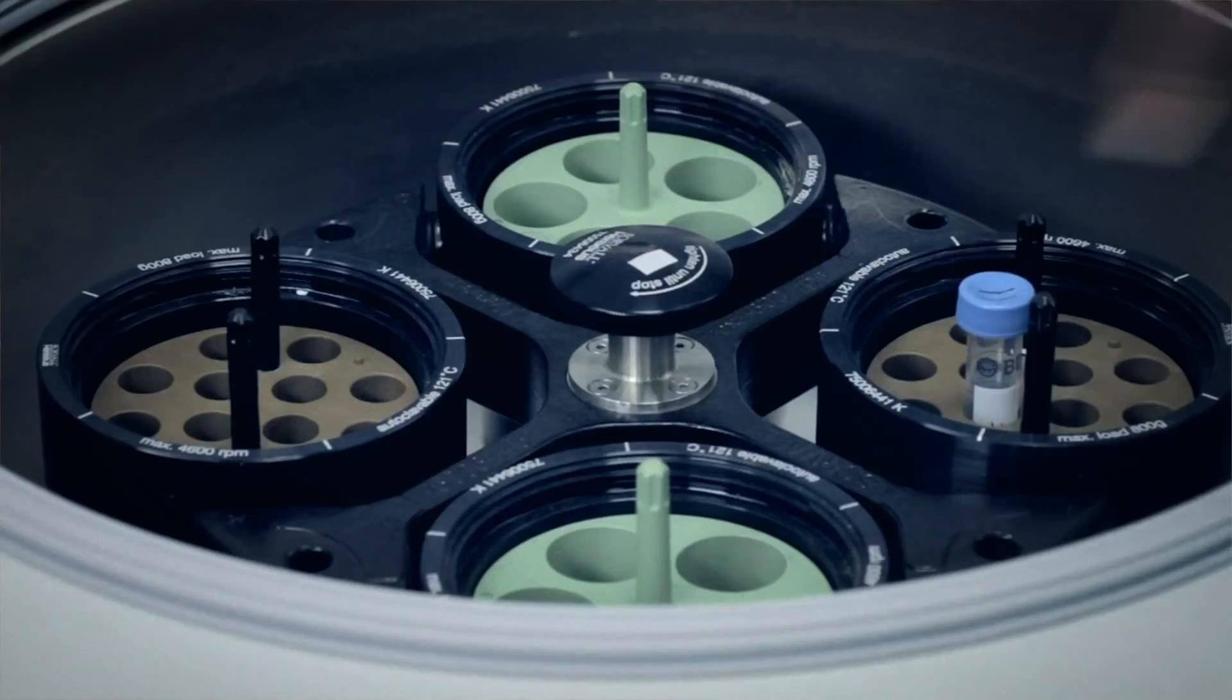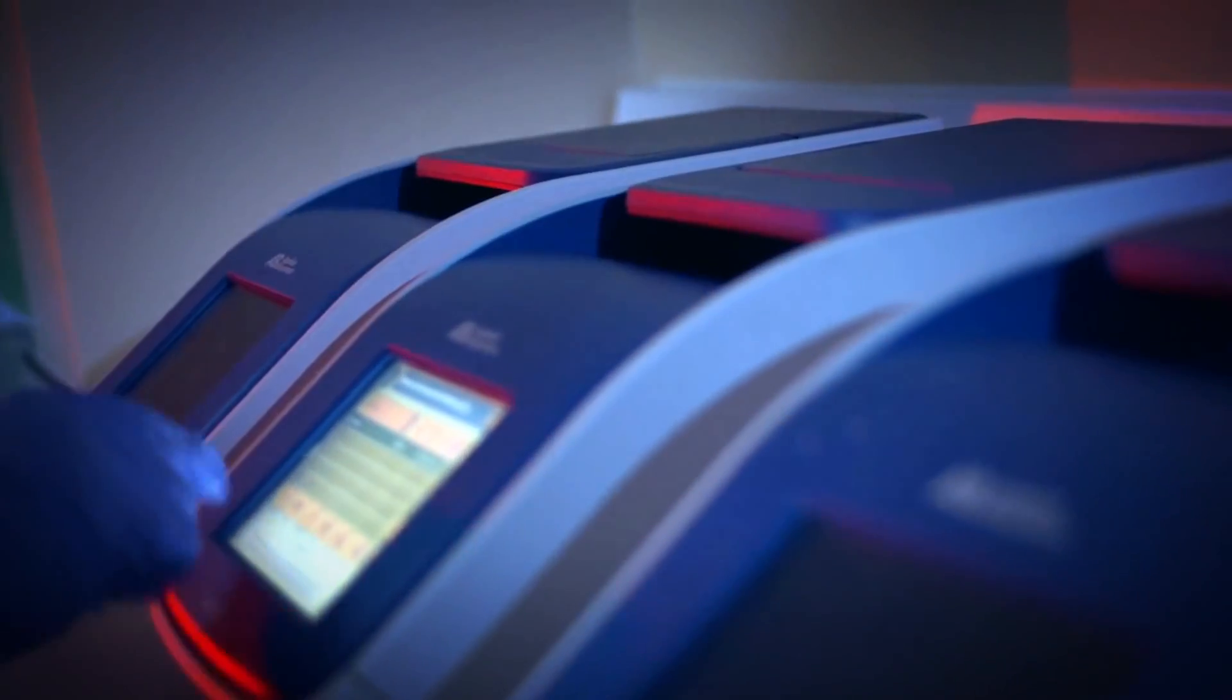And although we understand it, we're still trying to master it. PCR can be like this mysterious magic in a box where scientists put their precious samples in hoping for the results that they need. How many times have we seen it, the lucky dolls or the patting or rubbing of an instrument before a run?